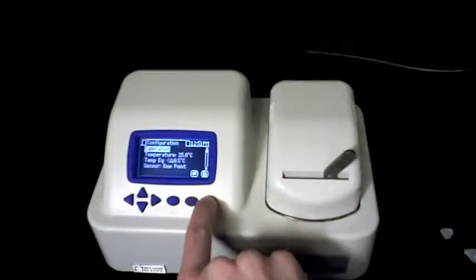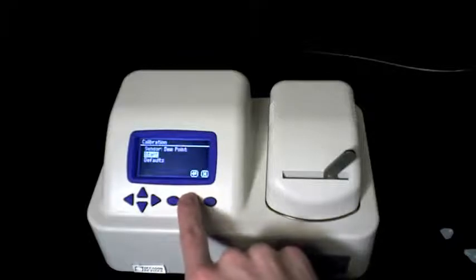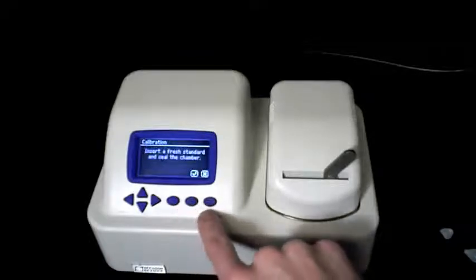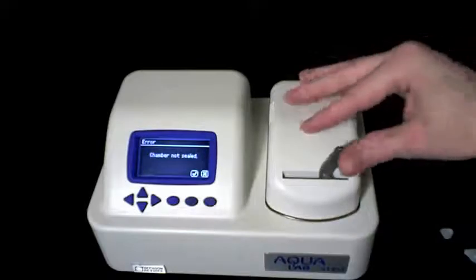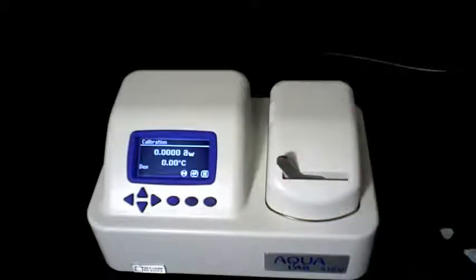Using your Aqualab's menu, select Calibration, and then Start. Turn the lever to Read, and the verification process will begin.